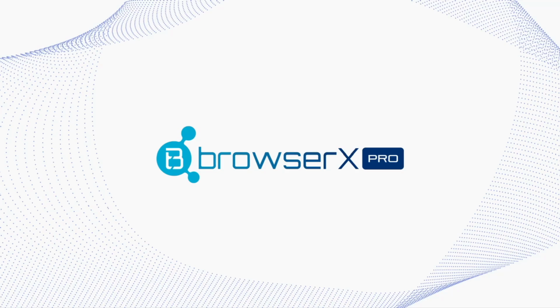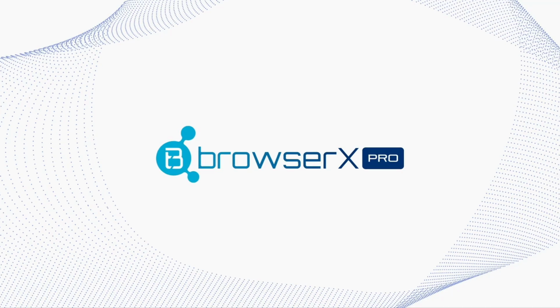Hi everyone, welcome to the tutorial on BBrowserX Pro, which is BBrowserX's platform for single-cell analysis and visualization. This tutorial will cover the essential steps of analyzing your own data, from uploading your data to cell type annotation to other downstream analyses. We'll focus on a specific case study combining two public studies and explain how you can gain biological insights from the analysis that you perform on BBrowserX Pro.